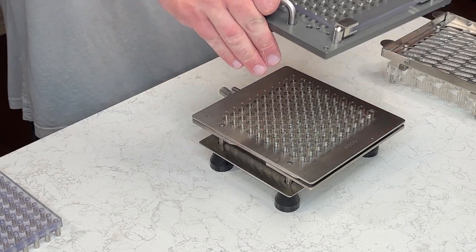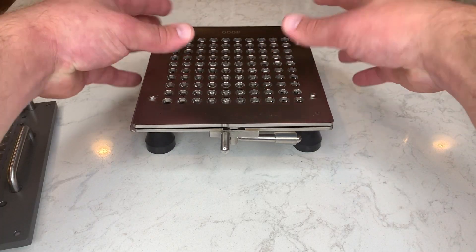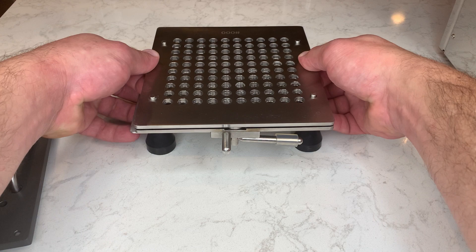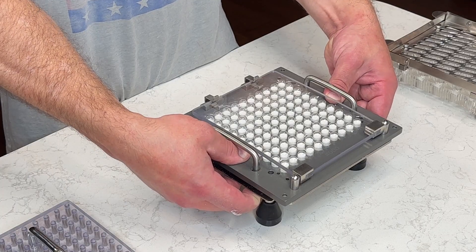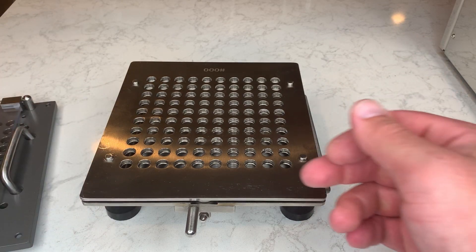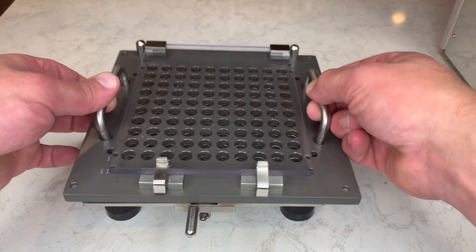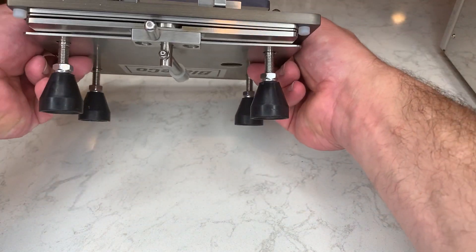Looking at it, you might notice that instead of pressing down to lock your capsules together like most machines, the Pro-Op 100 lets you pull the capsule bottoms upward to lock them into the capsule tops. Made completely of metal, it's the model of choice for professional users in all industries alike for ease and precision.